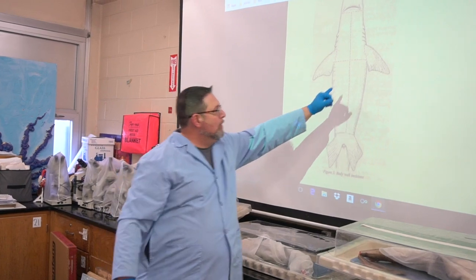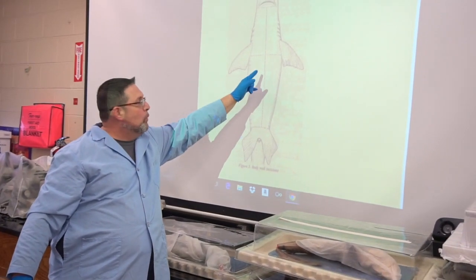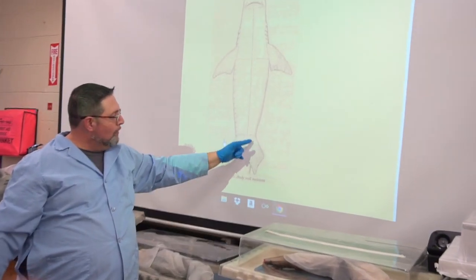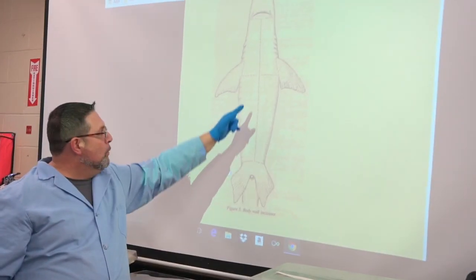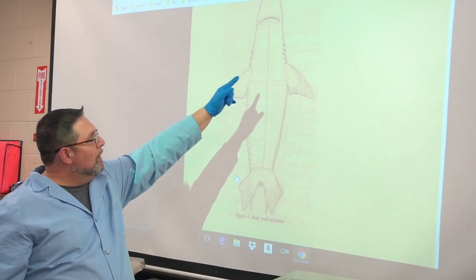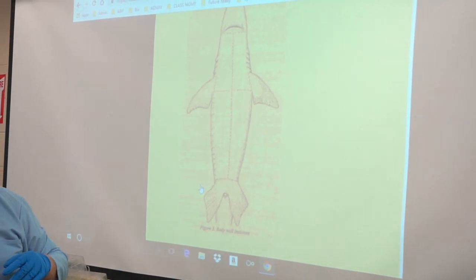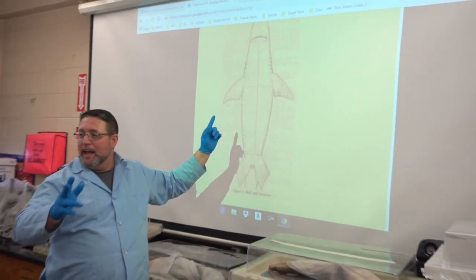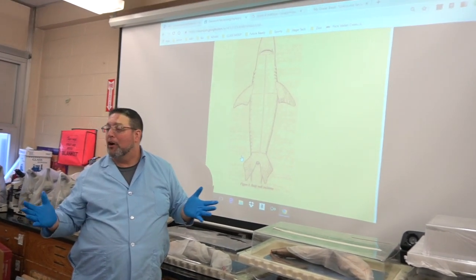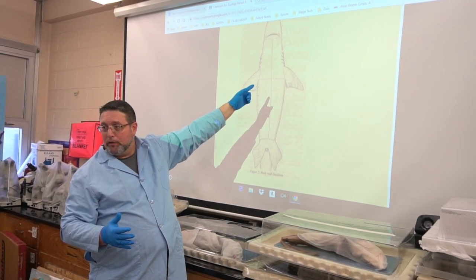Your cut is approximately in the middle of the shark, okay? What we want to do is extend that cut all the way posteriorly, just anterior of the pelvic fins. We want to extend it anteriorly up towards the mouth. When you get up around where the gill slits are, you're going to find a piece of cartilage there to protect the heart. We're going to need to get over that and up beyond it to be able to expose the pectoral cavity and see the heart, and the pericardial cavity, I should say. So that's going to be one of the harder parts of your opening.